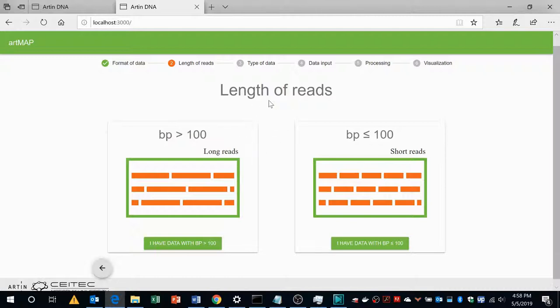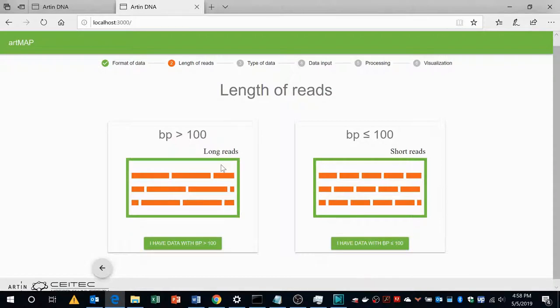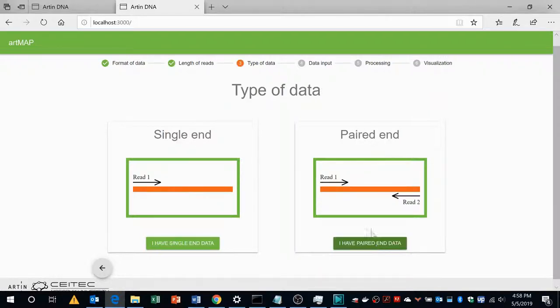The second question it will ask is about the length of the read. It can be long read or short read. In our case it is short read which is less than 100 base pair. I will go for short read.